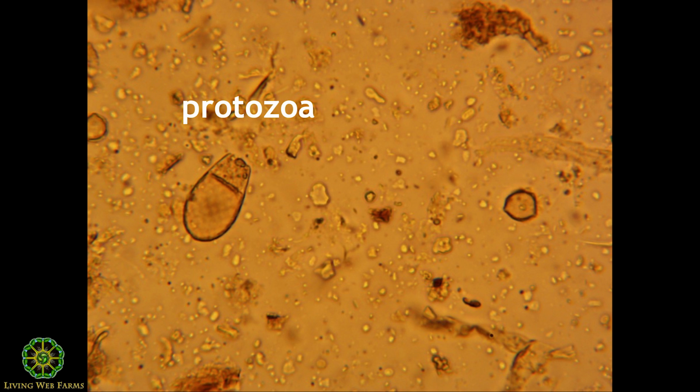And if they're super ornate and double-walled, in general, they're amoeba. And if they're smaller and single-walled, they're going to be flagellates or ciliates. So those are the three main groups of protozoa that you might see.